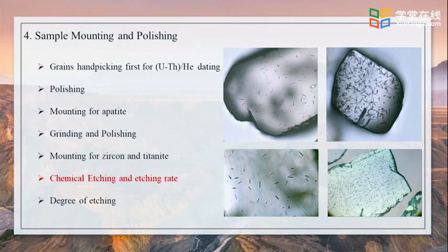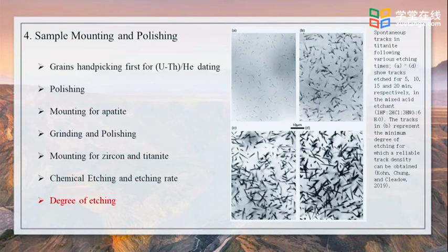Apatite and zircon grains are often prismatic, and during mounting often tend to align on prismatic faces, which are approximately parallel to the C-axis. Over or under etching may jeopardize the quality of data obtained because irradiation damage does not accumulate to any degree in apatite.